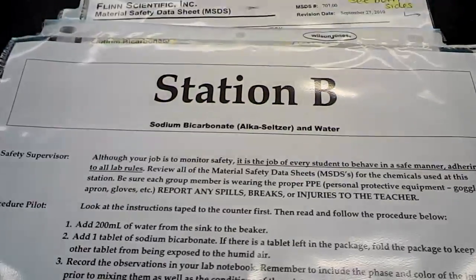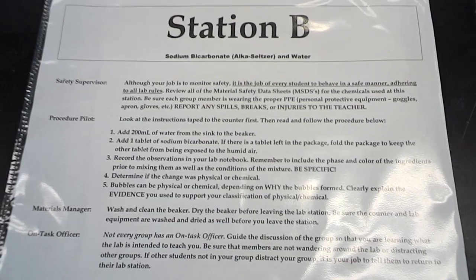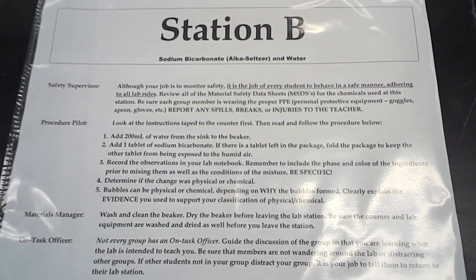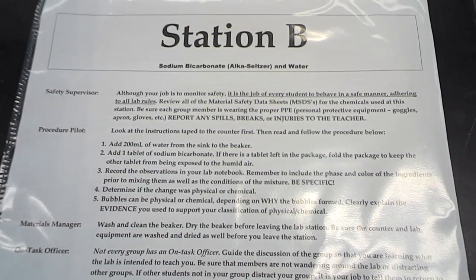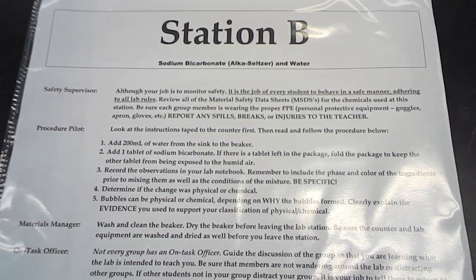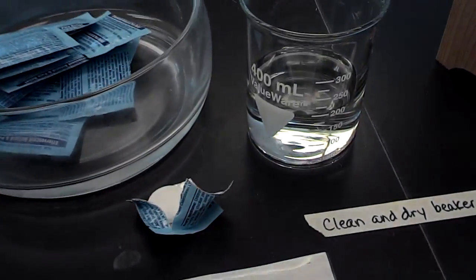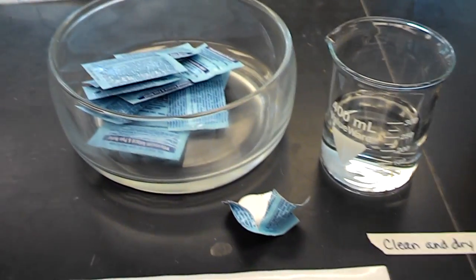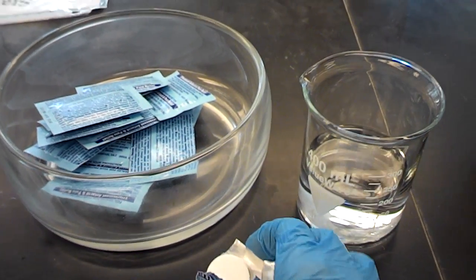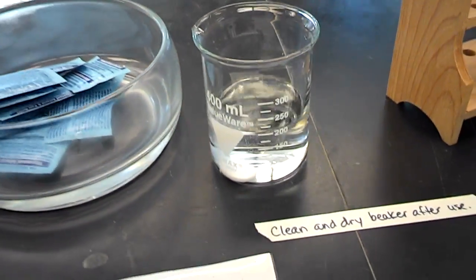Station B is sodium bicarbonate, which is Alka-Seltzer, added to water. The safety supervisor tells you that you do need to wear your proper PPE, your goggles, apron, and gloves. The procedure pilot would make sure that you follow all the procedures. First, it asks you to put 200 milliliters into a beaker of regular water. Then you're going to take 1 tablet and add the tablet to the beaker. Observe your results.